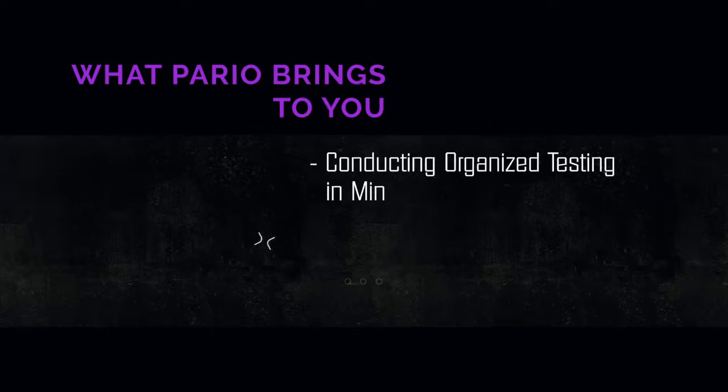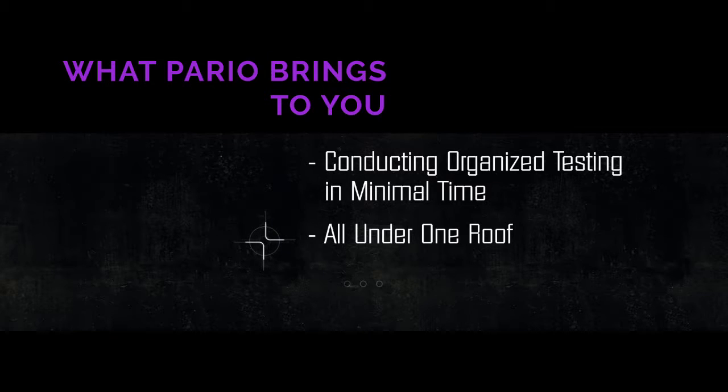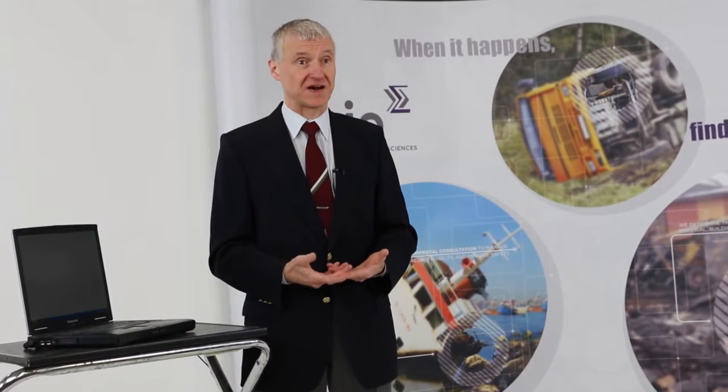Having destructive testing, which is another part of the investigation, organized within one day, within a few hours, instead of having all the parties involved traveling to other laboratories or scientific institutions like University of Toronto or McMaster University. That allows us to determine the root cause of the failure very quickly and precisely, considering the amount and type of equipment we have here in our laboratory.